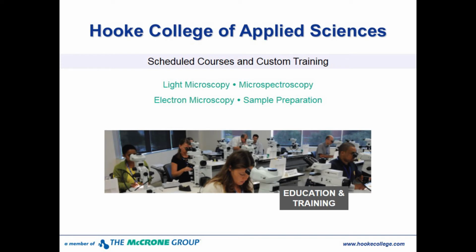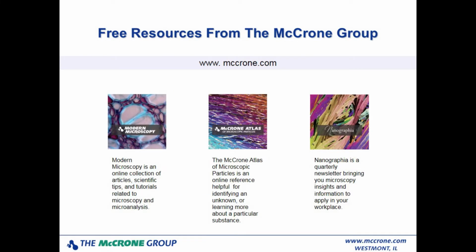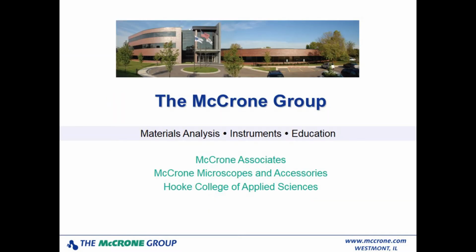And then I would begin to try to remove the substance with a least severe solvent, going up to more severe solvents. Of course, all that information is quite good because it's telling you something about the material that's there. So I might start with water, although that's not really a non-severe solvent, and then move up from there.